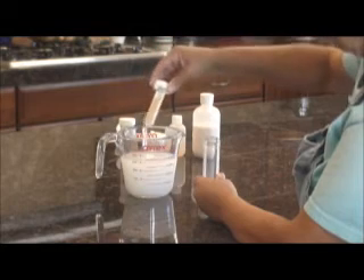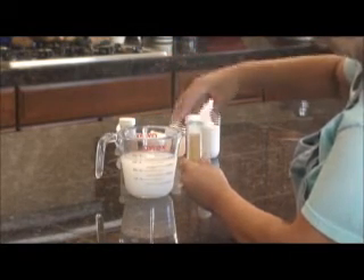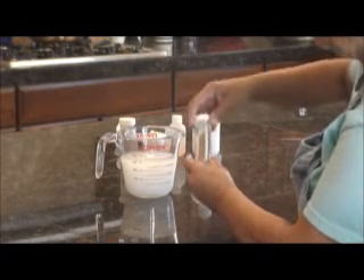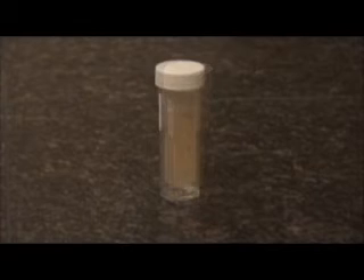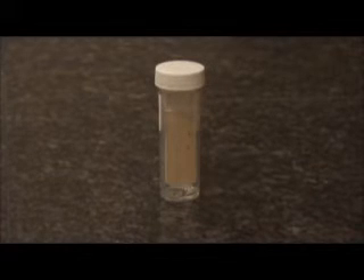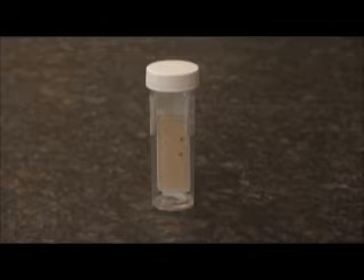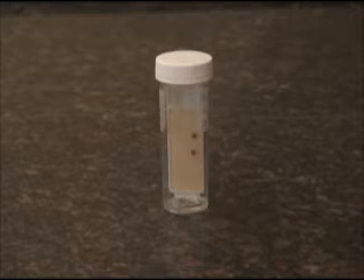Allow to incubate in a warm, undisturbed place. Ensure that the slides are protected from animals and children. I find the top of my refrigerator is an ideal spot for incubation. Active cultures can be a source of infection. Examine your slides every 24 hours for growth. Red dots begin to show bacterial colonies within 24 hours but continue to develop. The final bacteria picture is after five days of incubation.